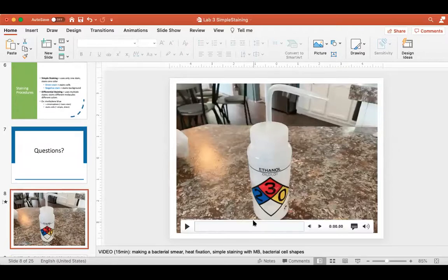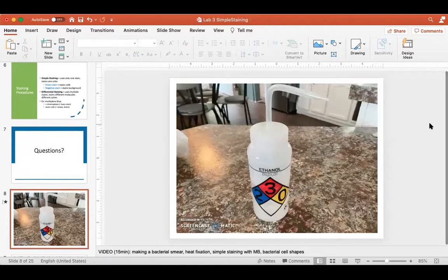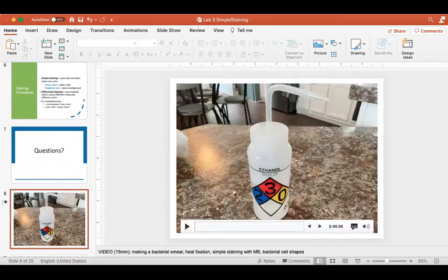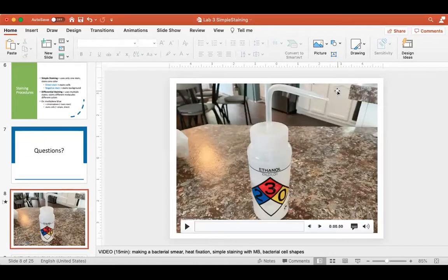Now we're going to watch a video together that walks us through a simple staining procedure. Before I start, I want us to look at this container — a popular type of squeeze bottle you might see in a lab. You give the body a little squeeze and squirt out whatever's inside through the nozzle, rather than using a trigger spray. This is a bottle used for daily disinfecting. Remember, when we come into the lab the very first thing we do each morning is disinfect our workspace.